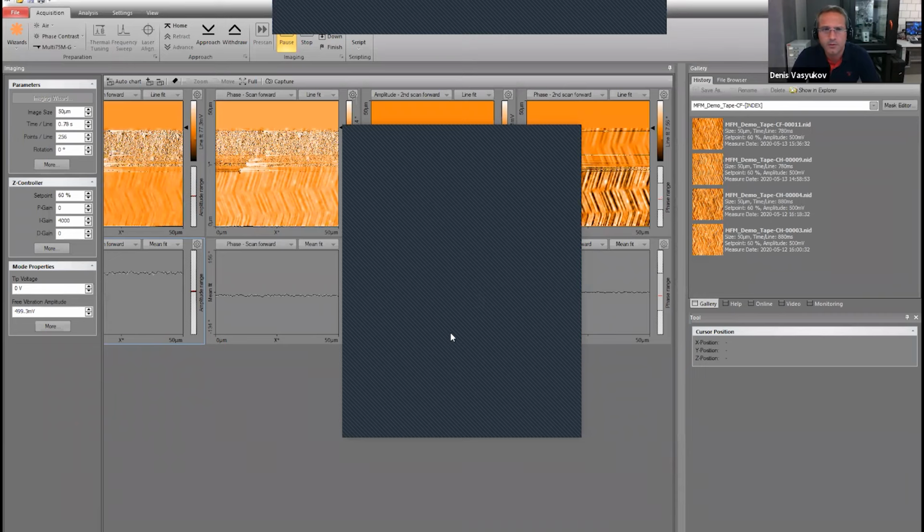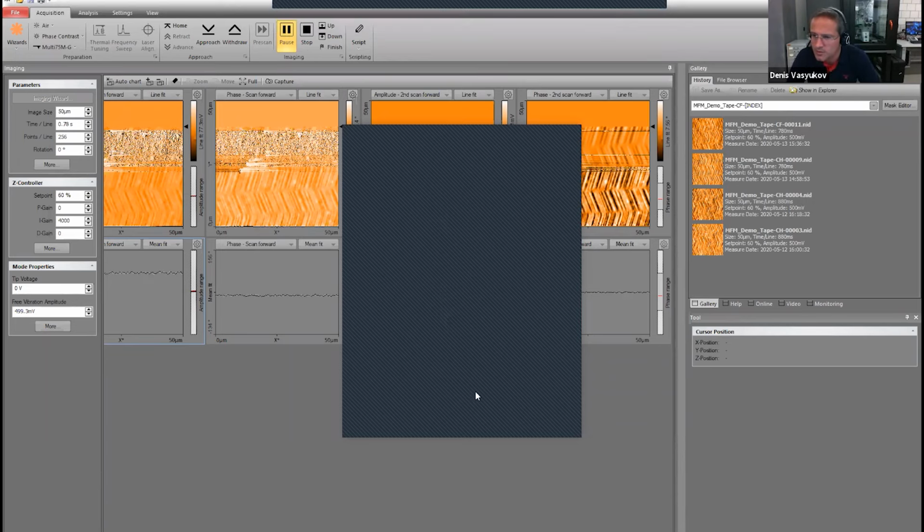I don't have any more questions. I know there is one more question coming. Is there a way to look simultaneously at magnetic and electric properties of the material, such as performing EFM and MFM correlatively? Is that technology out there?